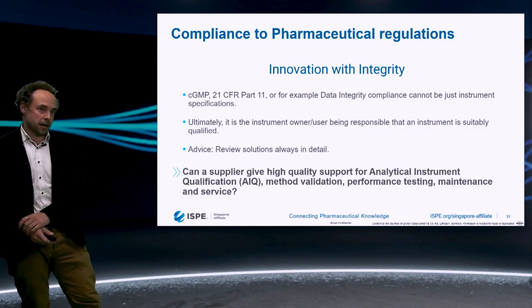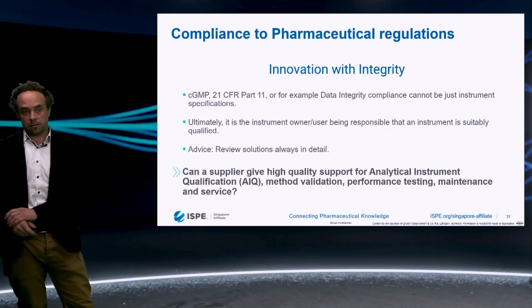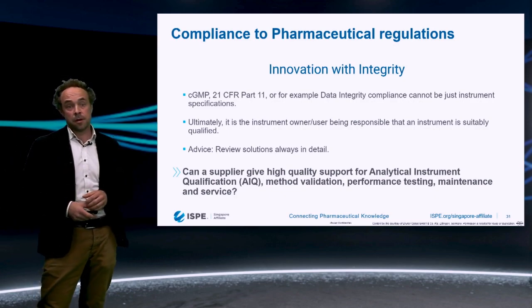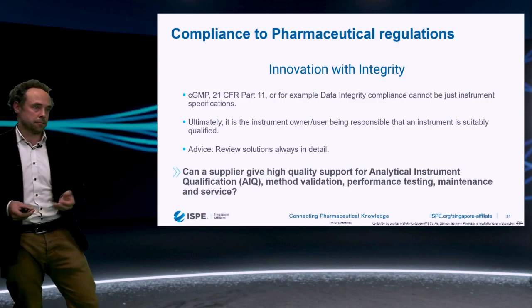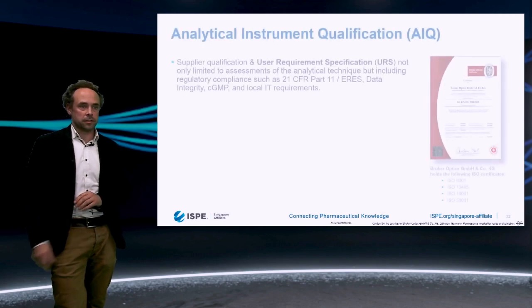Can a supplier give adequate support for instrument qualification, and later on for method setup and validations? Are there adequate programs for performance testing, and maintenance programs and services available? Those are all important topics.